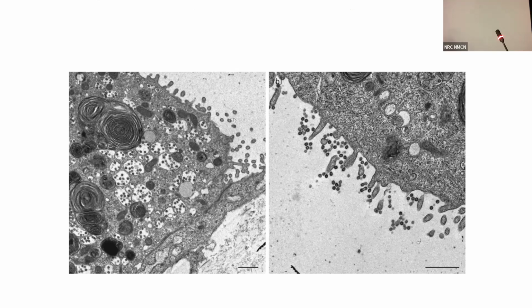So why am I showing you this electron microscope picture? Something which was causing havoc in your life for the past 2.5 years: COVID. Virus particles, can you look at them in the light microscope? No. So what do you require? You see these beautiful viral particles here, right? If you have a high resolution, better microscope, you can even look at those spikes, the corona spikes. That is why it is known as a coronavirus. So these are the virus particles.